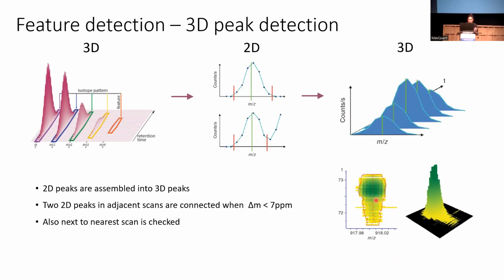And you can see that there is also the very wiggly line, right? It's almost like a straight line, but it's really not, which, of course, you expect some irregularities. So we did that.